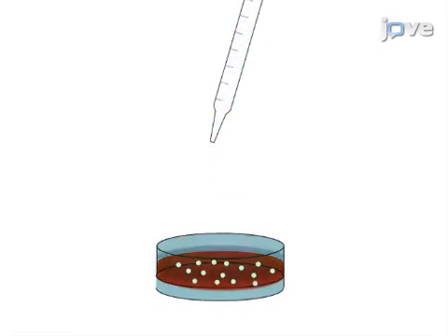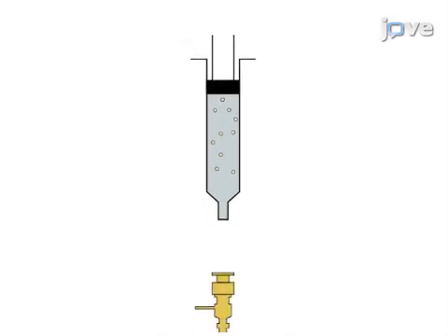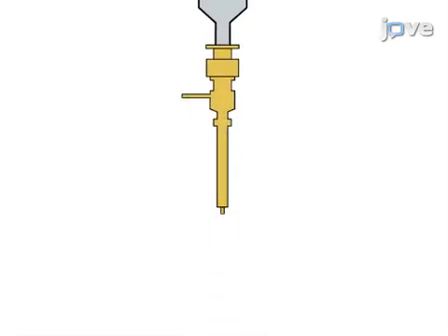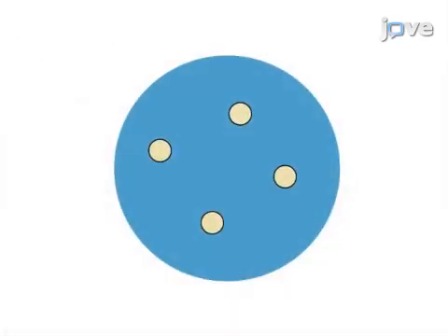The mixture is then transferred to a syringe and a coaxial nozzle is installed on the syringe before setting them on a syringe pump. Next, the droplets are prepared by expelling the cell suspension with co-flowing nitrogen gas, followed by collection in calcium chloride solution.